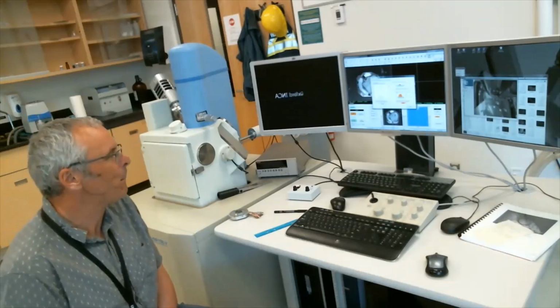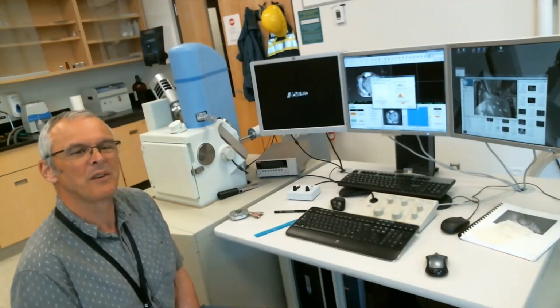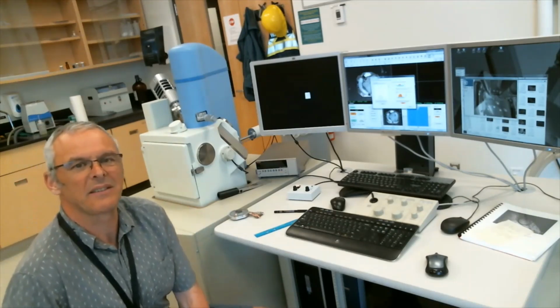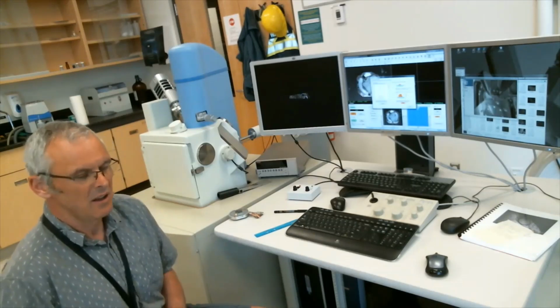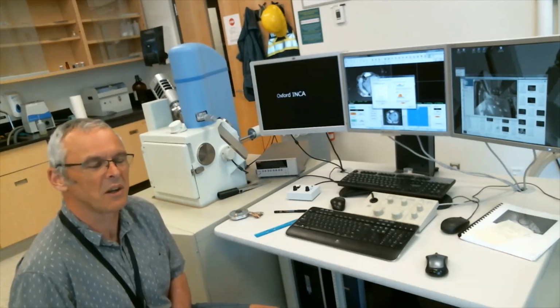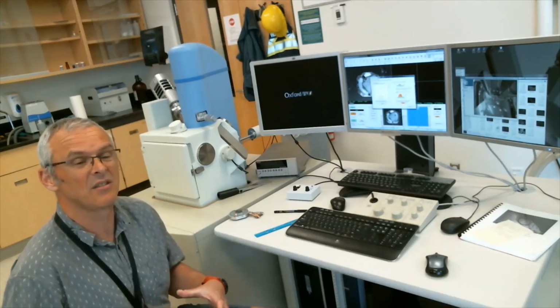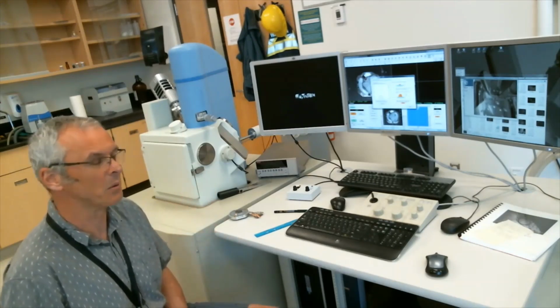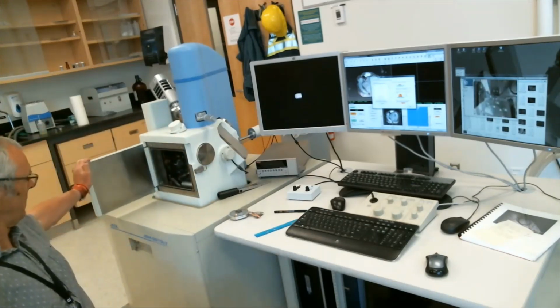The SEM is a great tool for surveying when we've got samples that are rough and irregular, when we've got samples that we haven't been able to pull apart and we can't polish. It's a good tool for general survey work and a lot of actual good final work because it's very flexible. One of the things in this particular machine that makes it very flexible is that it's got an enormous sample chamber.